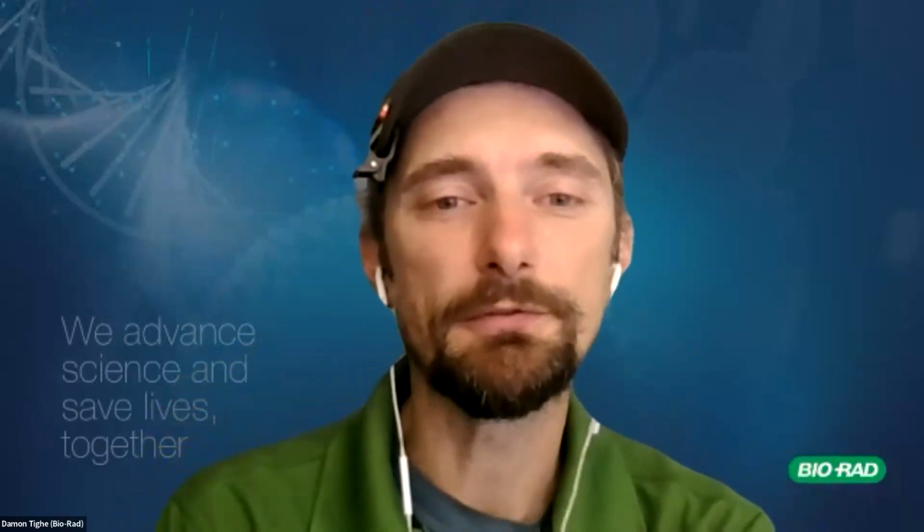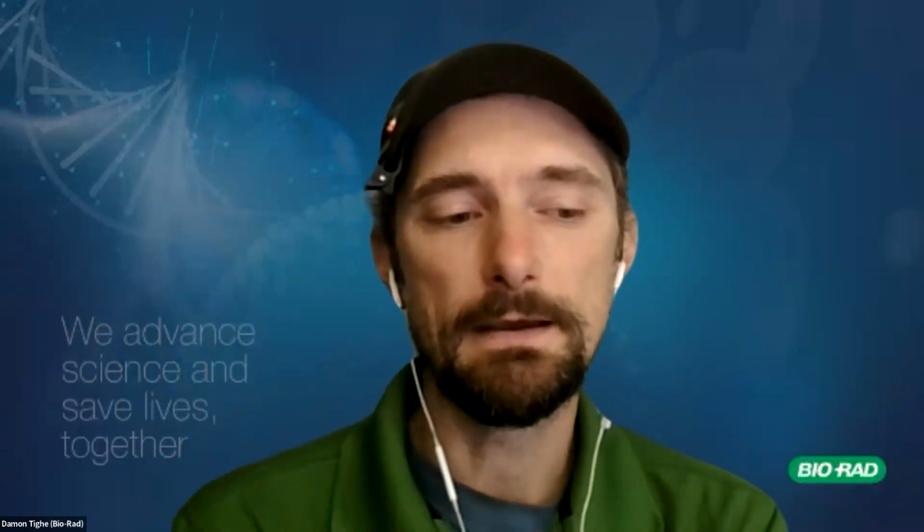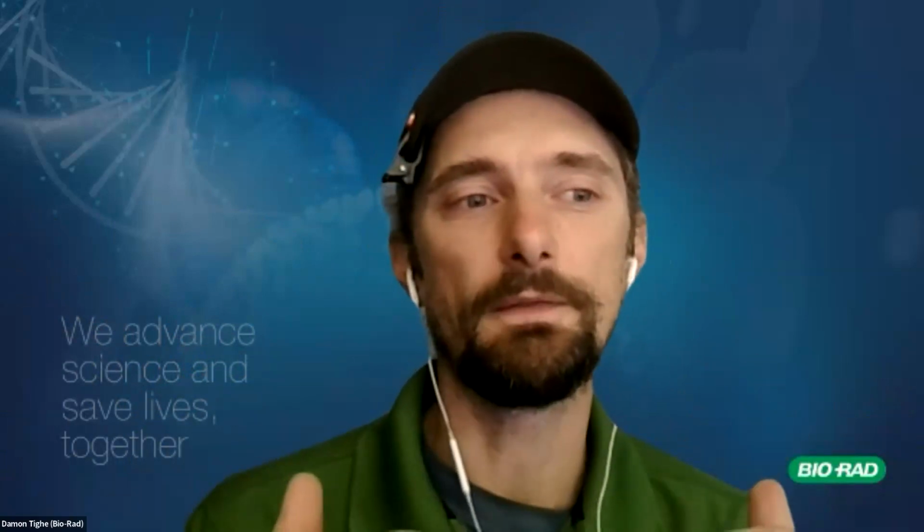So if there aren't any questions right off the top of anyone's head, I can get started with some general ideas of how to bring some of these concepts into the classroom. I predominantly have worked with a lot of high schools in bringing PCR in, but I have a handful that bring real-time PCR in. I interact with a number of colleges and small universities that are also bringing it in. To some degree, it comes down to what your pipeline is focused at. But the biggest thing I see across all of them is making sure they have a very solid fundamental understanding of PCR inside and out.